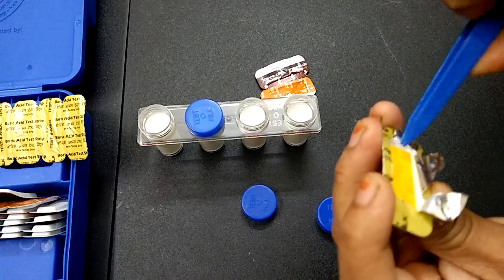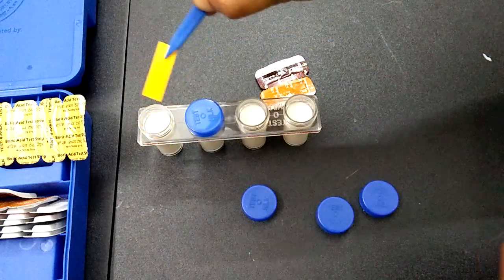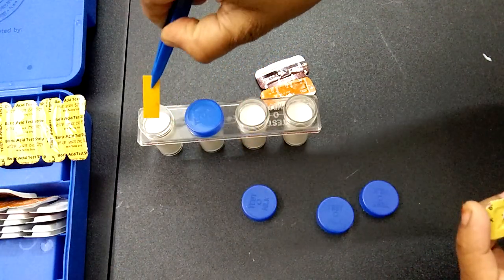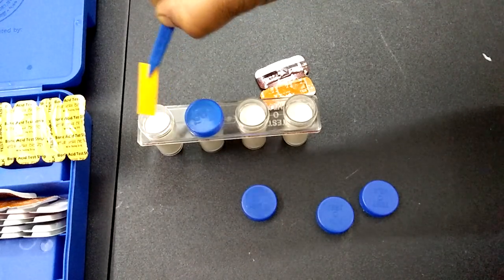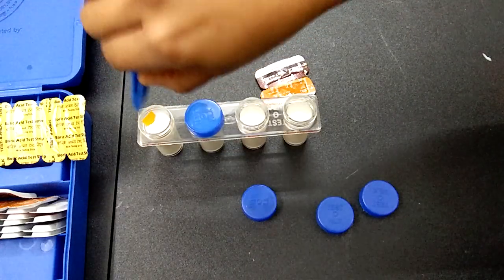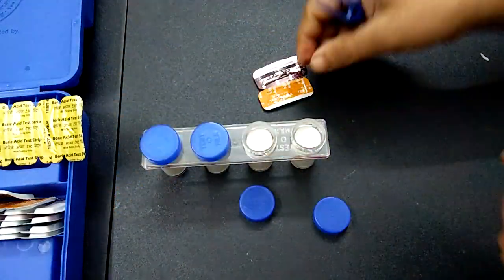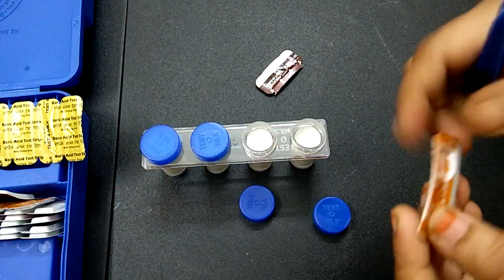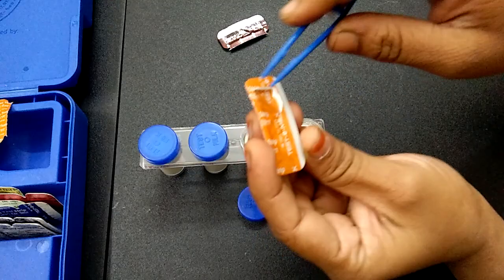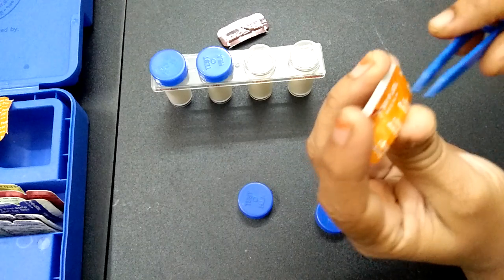With the help of forceps, we take the boric acid strip and dip it into the boric acid jar. Dip it completely and close the lid — I have tightened the screw. Now let's do the next test. This is the detergent strip, let's open it.